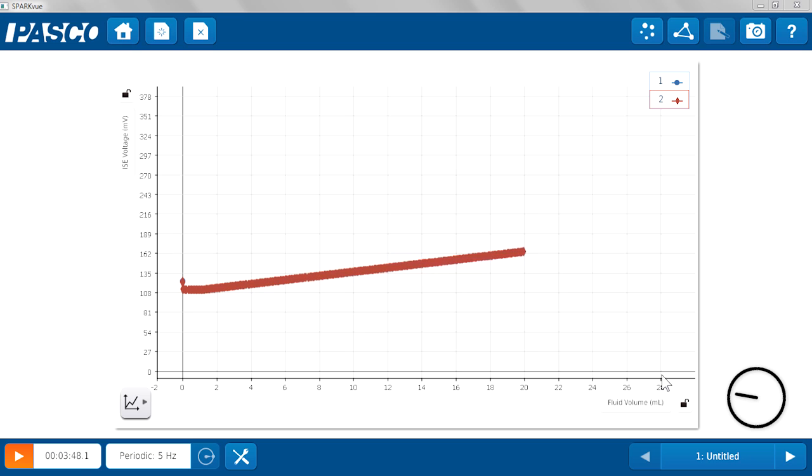And we're almost to the equivalence point. And I can see it's starting to rise. And our titration is just about complete.